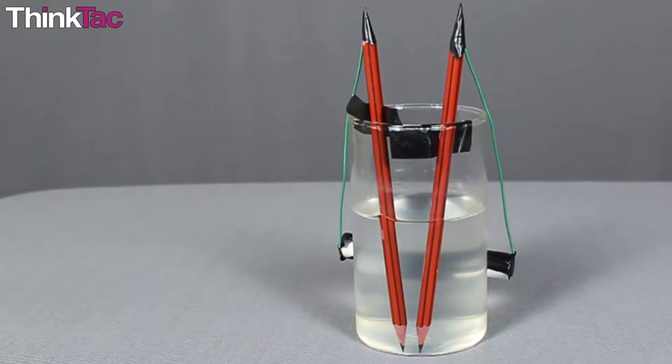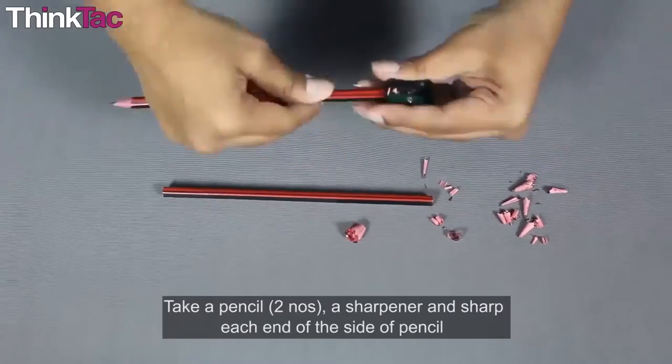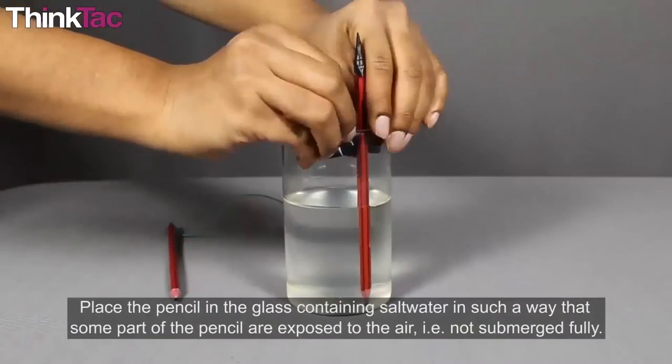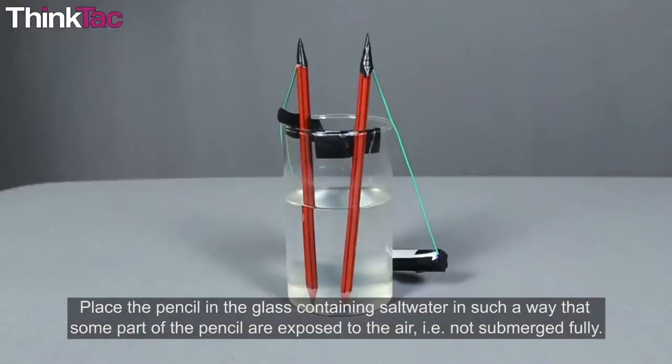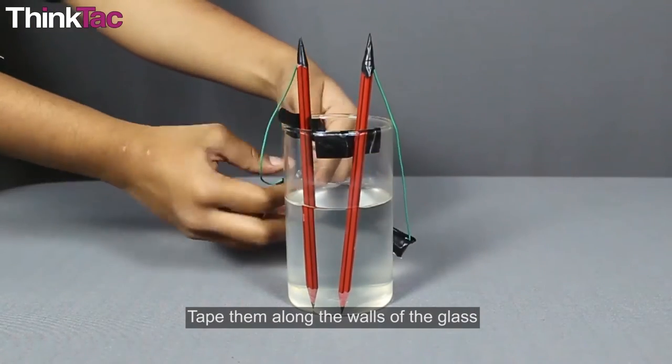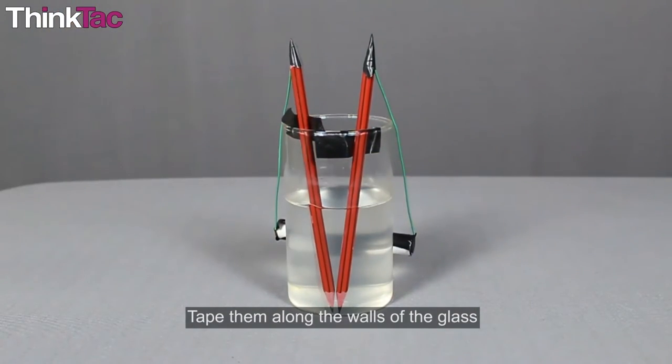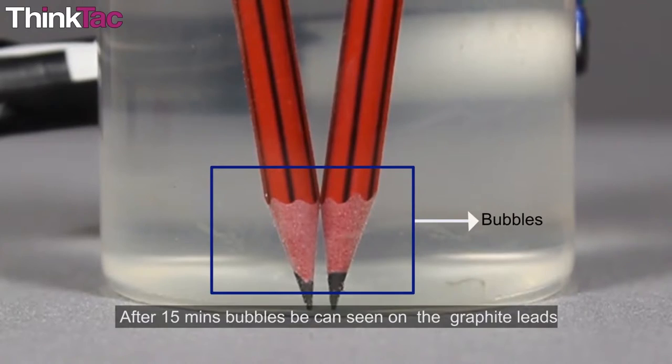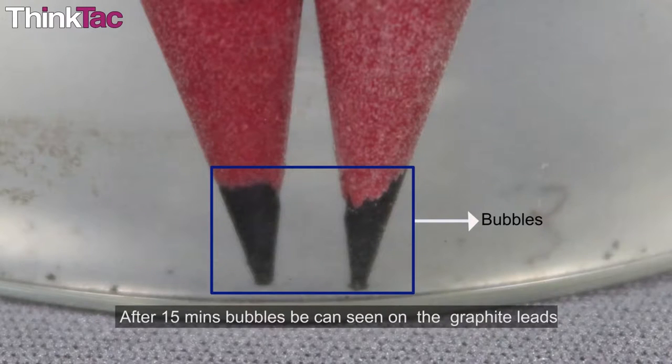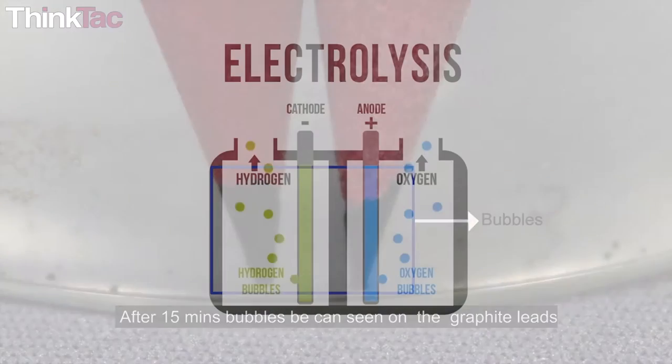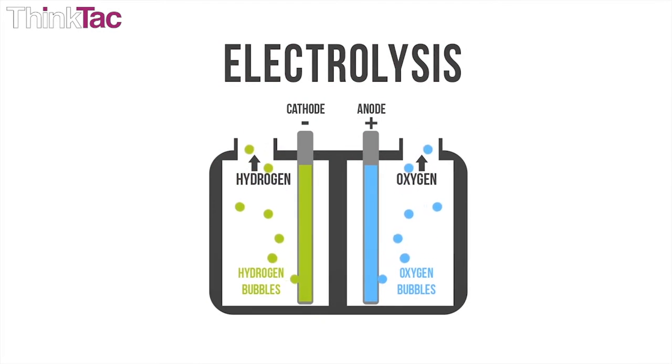One interesting variation is using two pencils instead of iron nails. Take two pencils and sharpen them from both the ends. Dip one end of both the pencils in the aqueous medium and attach the other ends with the wire to the two terminals of the cell. You will see bubbles coming out of the tips of the pencils and coming up. This happens as the pencils act as the electrodes and the graphite transports electricity.